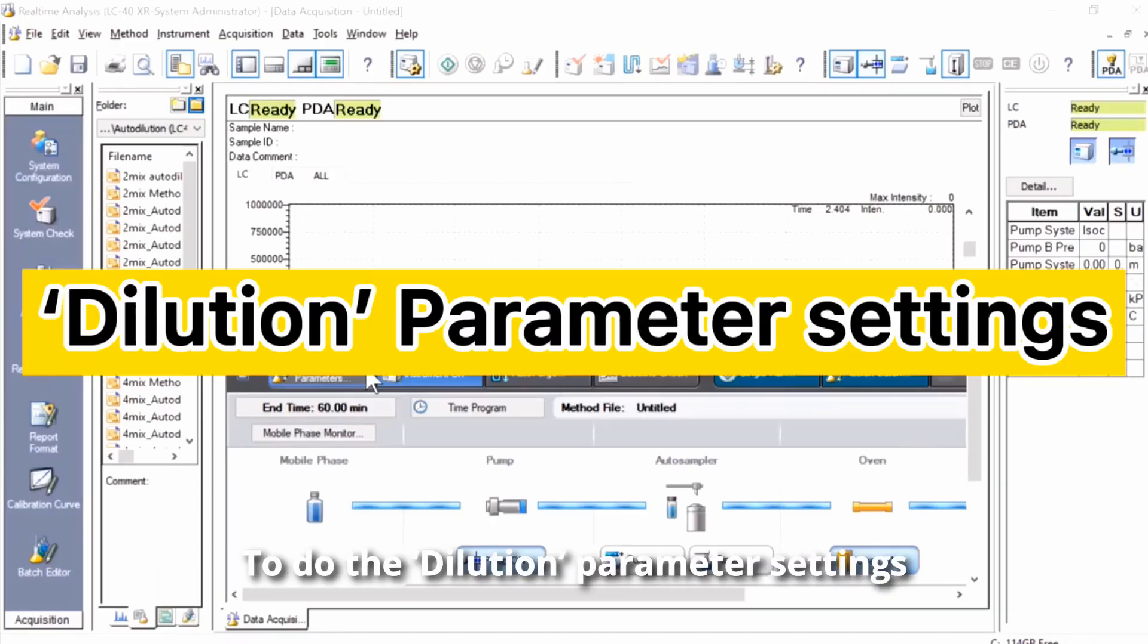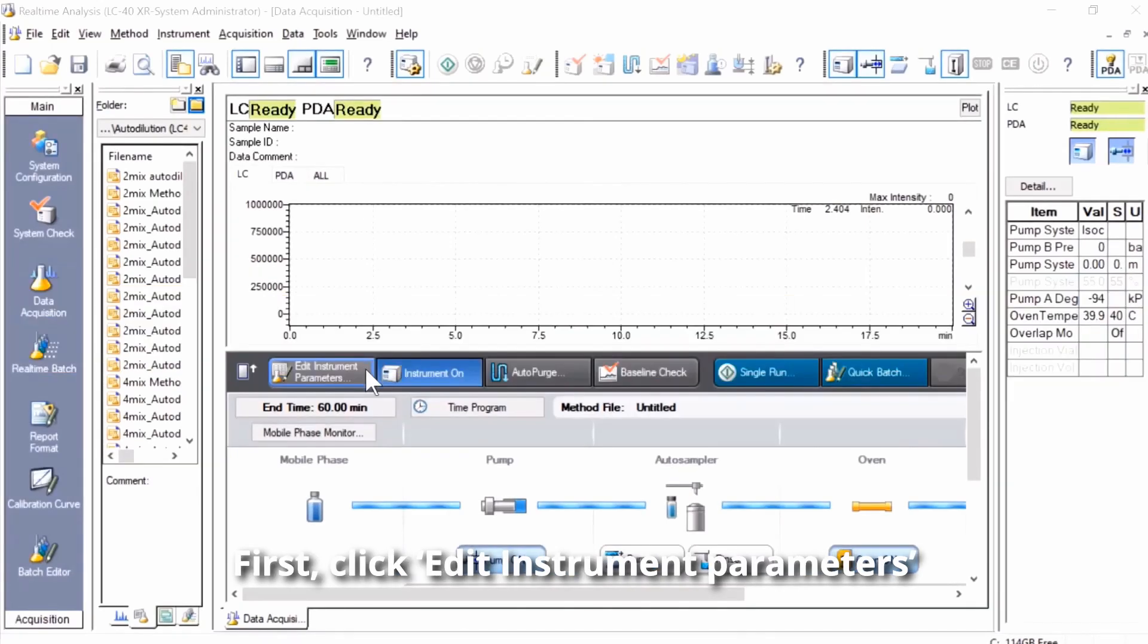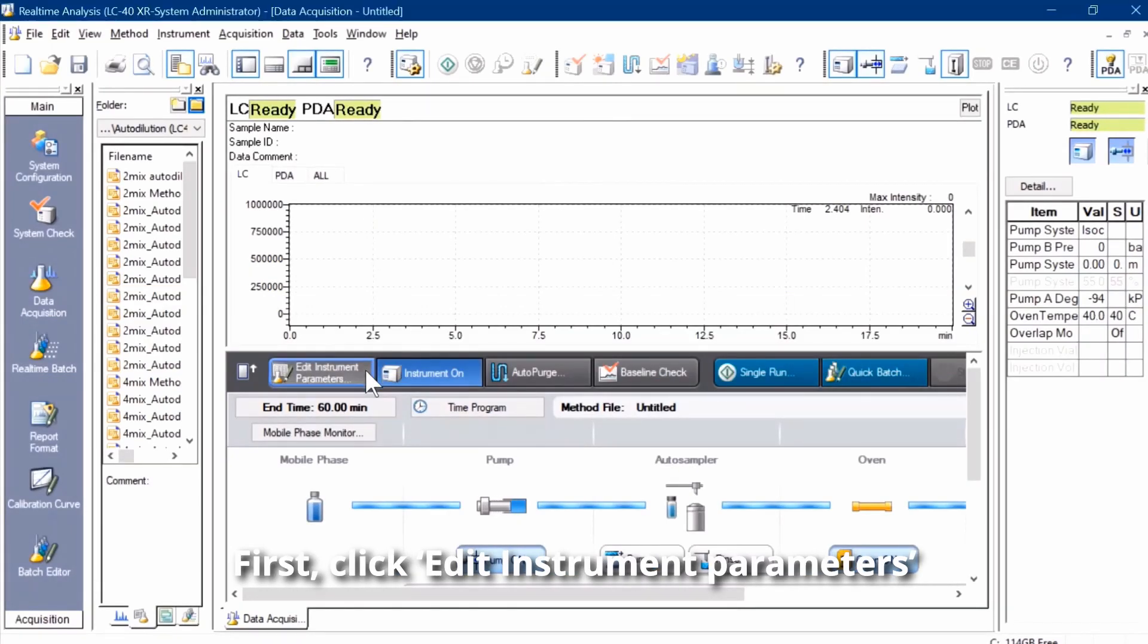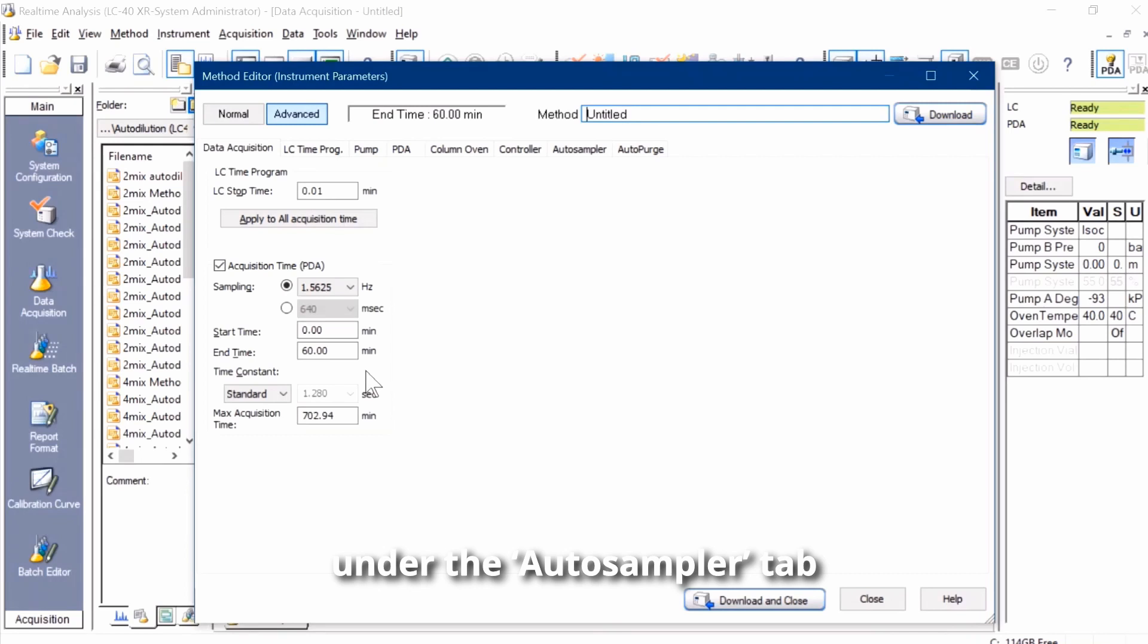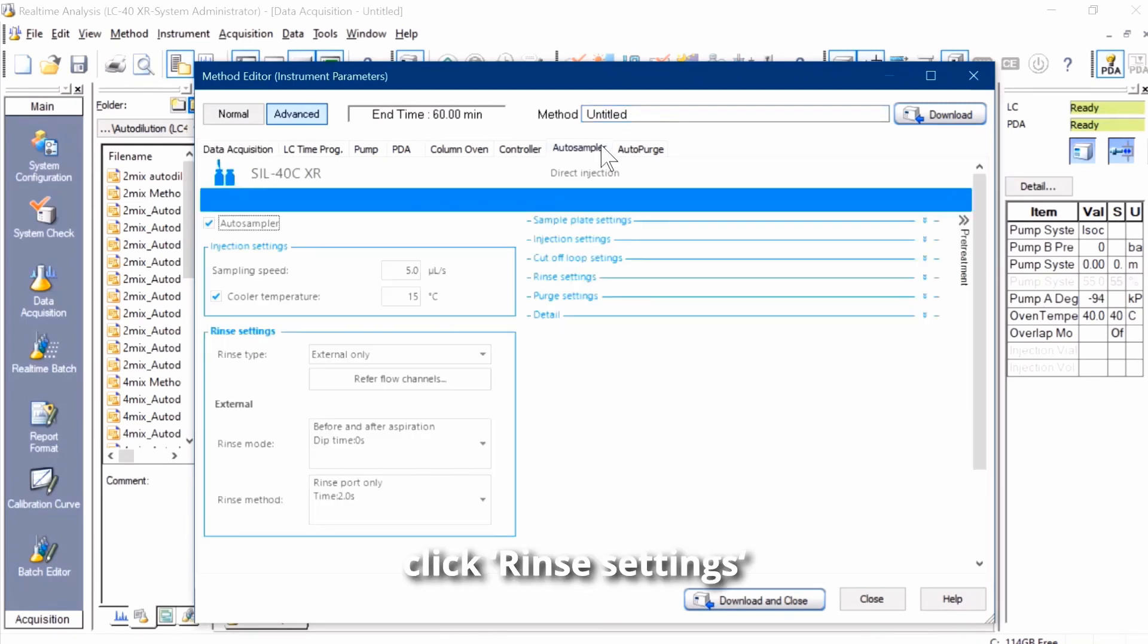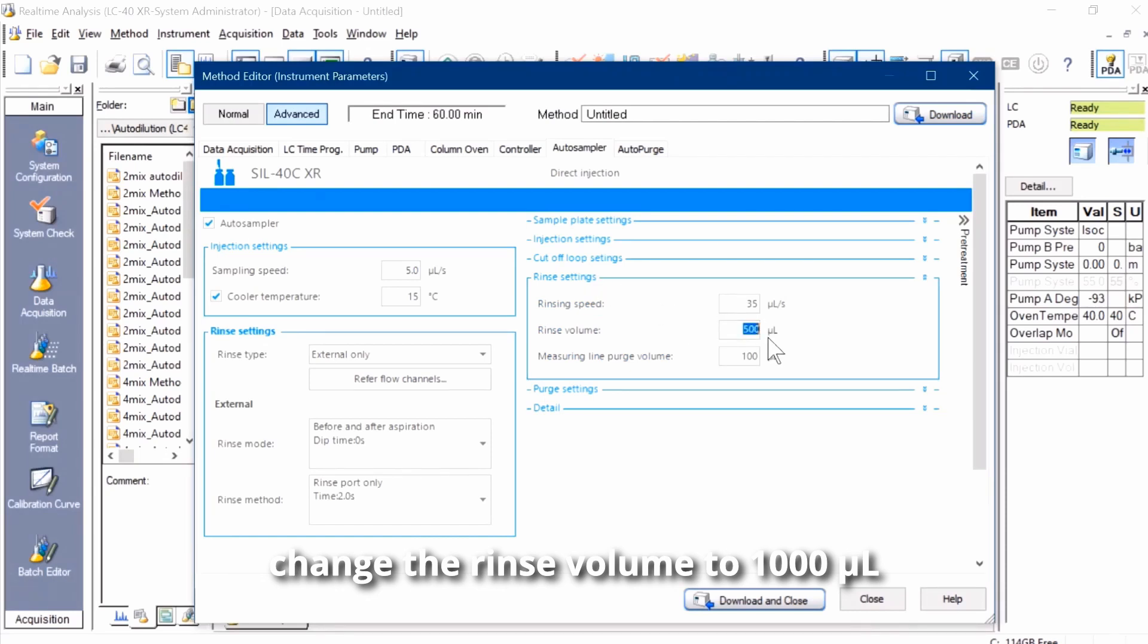To do the dilution parameter setting, first click Edit Instrument Parameters. Under the autosampler tab, click Rinse Settings, change the rinse volume to 1000 microliters.